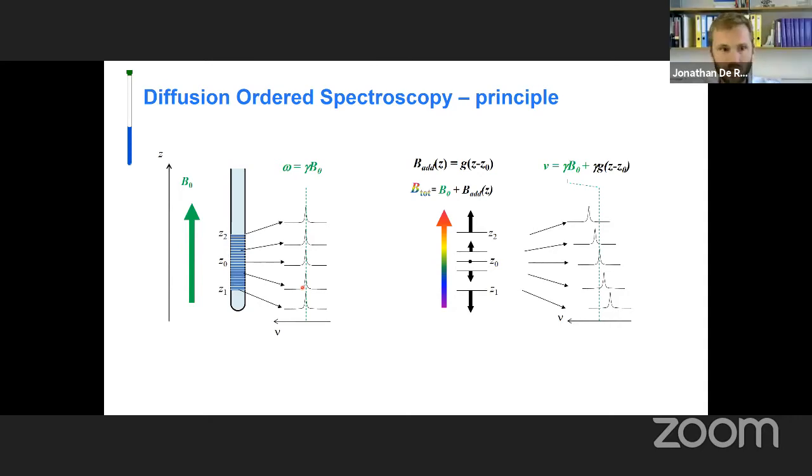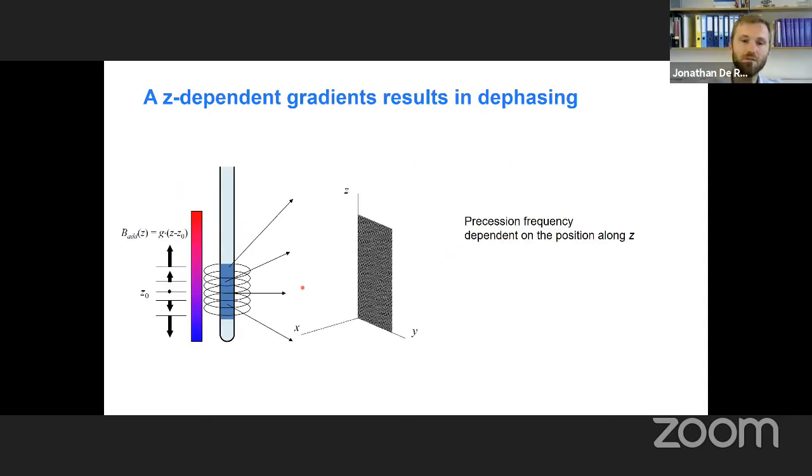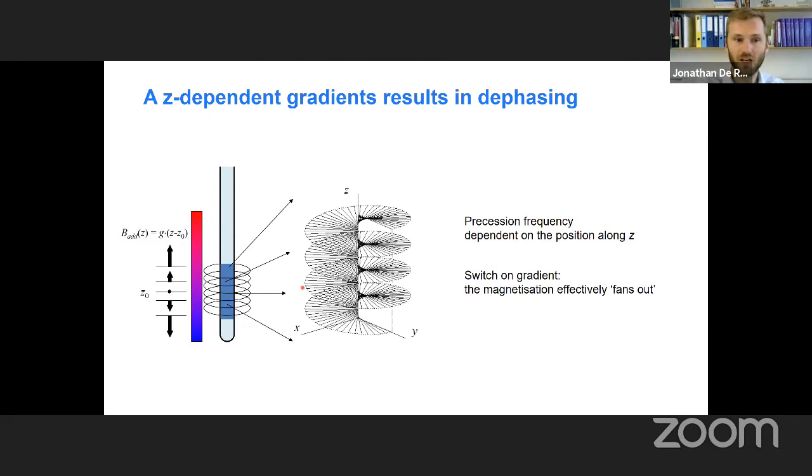So what's the consequence of that? Remember NMR magnetization: you first excite it, you put it in the XY plane, it starts to precess, but now every single one is going to precess with a slightly different frequency. If you wait a little while, they're all at such a different speed that you will completely destroy the coherence of that signal, and you have zero signal left.